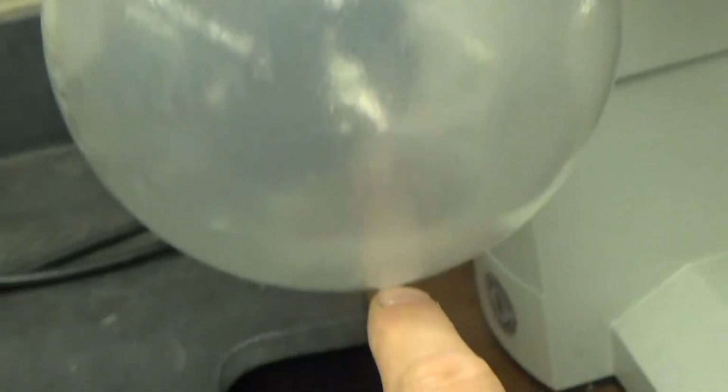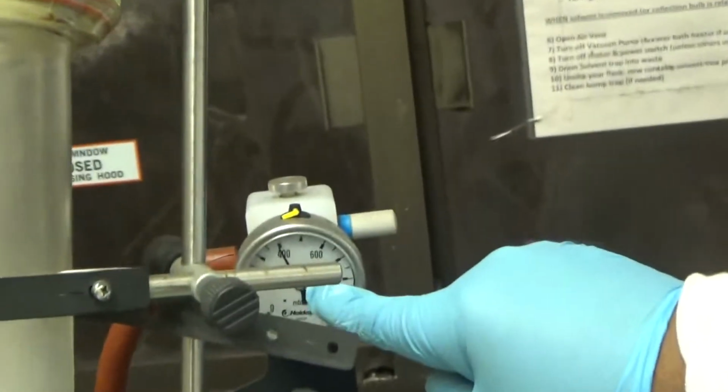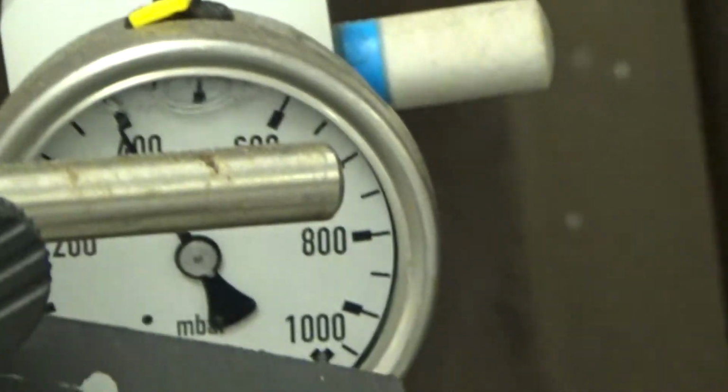Yeah, there we go. You see the pressure has to decrease. See the dripping? Okay. And I can check by looking at the pressure here. At this pressure, that has to come out, and it's coming out. At about 400 millibar, I think. Yeah, 400 millibar.